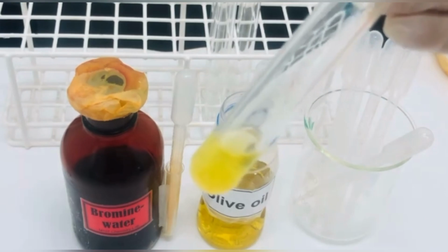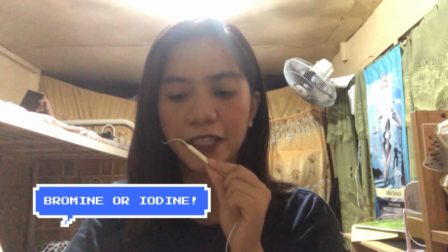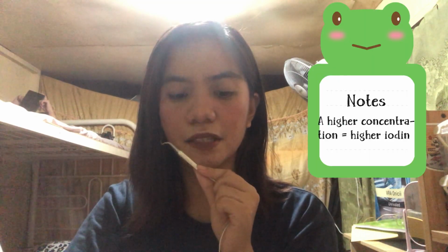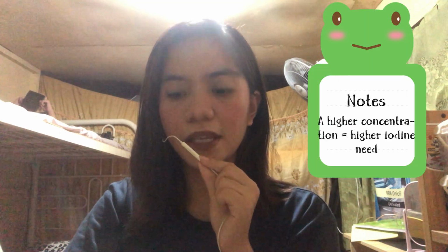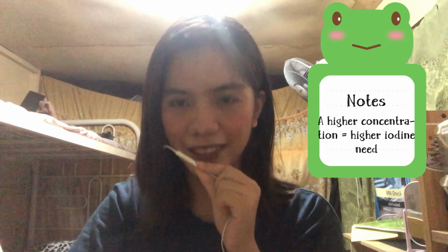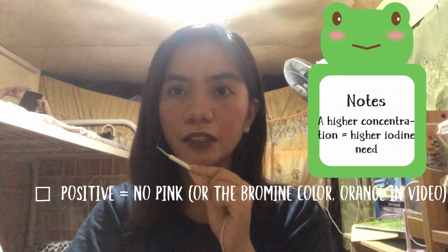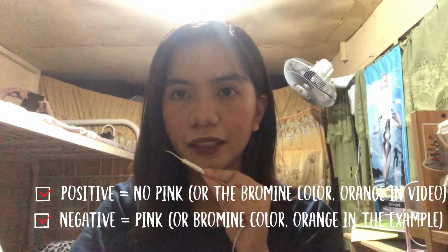and this shows that the oil is unsaturated. Unsaturated fatty acids have double bonds and become saturated when they absorb bromine or iodine. A higher concentration of unsaturated fatty acids or double bonds means a higher iodine need. So it is considered positive if the pink color disappears and negative if the pink color appears.